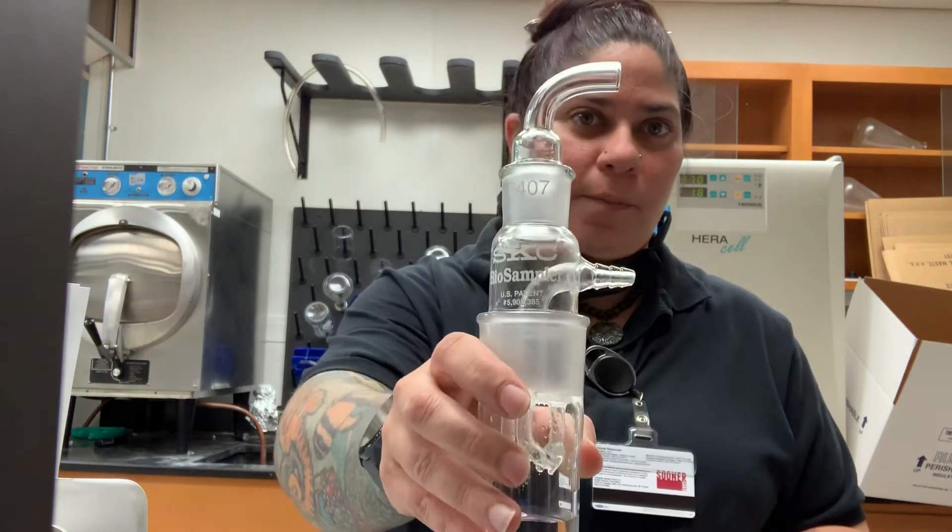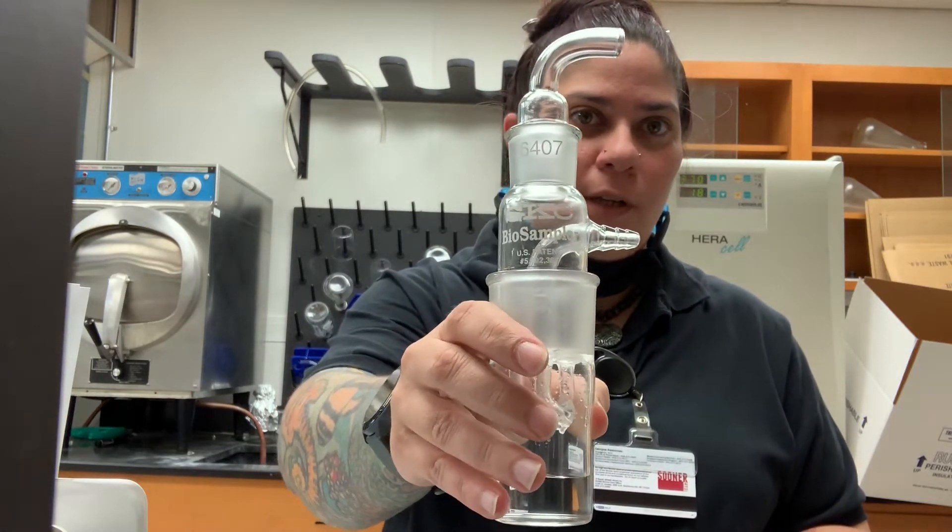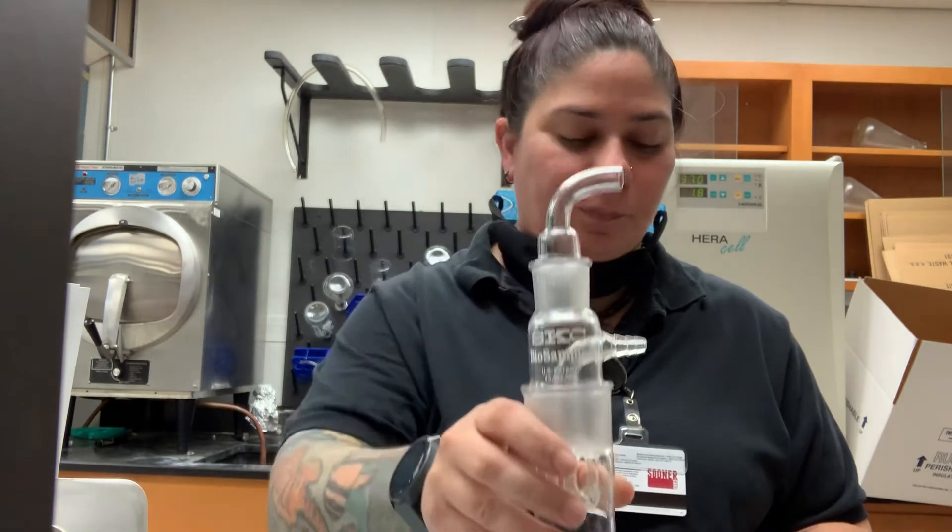This is a biosampler impinger. It is a three-piece impinger designed to collect aerosol particles using centripetal motion and directing that aerosol tangentially across the surface of a collection media. Particles under a certain cut size are entrapped in the media, and particles over that cut size are collected along the vessel walls.